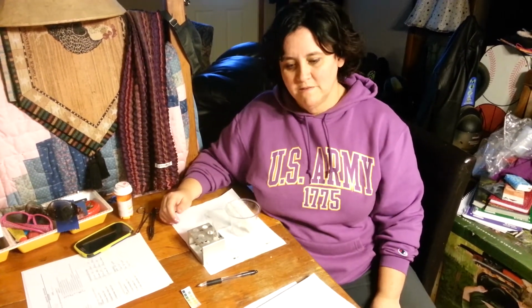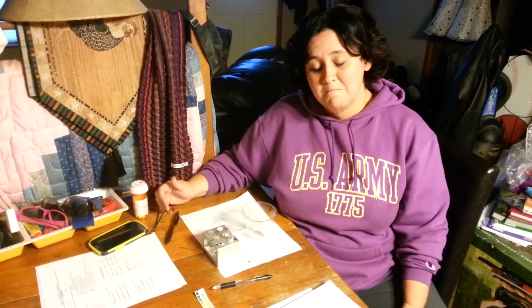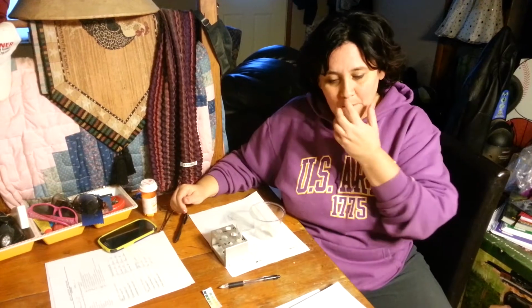I was picked today to do the digestive enzyme experiment for our YouTube video lab. And again, I apologize, I do not know how to upload the YouTube video, so I'm working on that as we speak. I picked the Amylase just because I thought it was the most interesting of our challenge. I thought this experiment was pretty cool, and I enjoyed it. I actually felt like I learned things in this experiment.